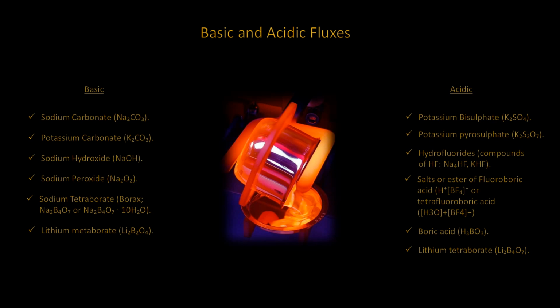For example, silica, being quartz, is very difficult to decompose, especially in a lithium tetraborate fusion. Silica is an acidic compound. Lithium tetraborate is an acidic flux. In order to decompose the quartz, a basic flux will need to be used. Lithium metaborate would be the choice. The lithium metaborate, being a basic flux, increases the basicity of the system, at the same time decreases the fusion temperature of the sample. The result is a better homogenized decomposition of the oxides in the melt.